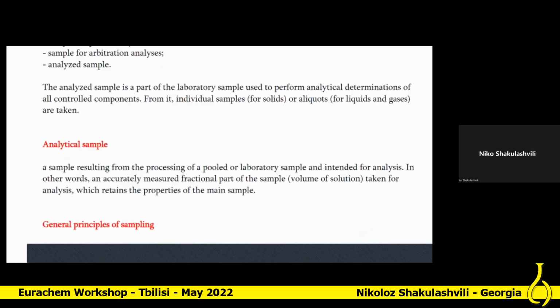And then in the laboratory, we take one part for initial analysis. Then the second one is kept and preserved for check, and the third is for analysis. The sample for analysis is the sample on which different analysis is carried out in the laboratory by using different equipment.